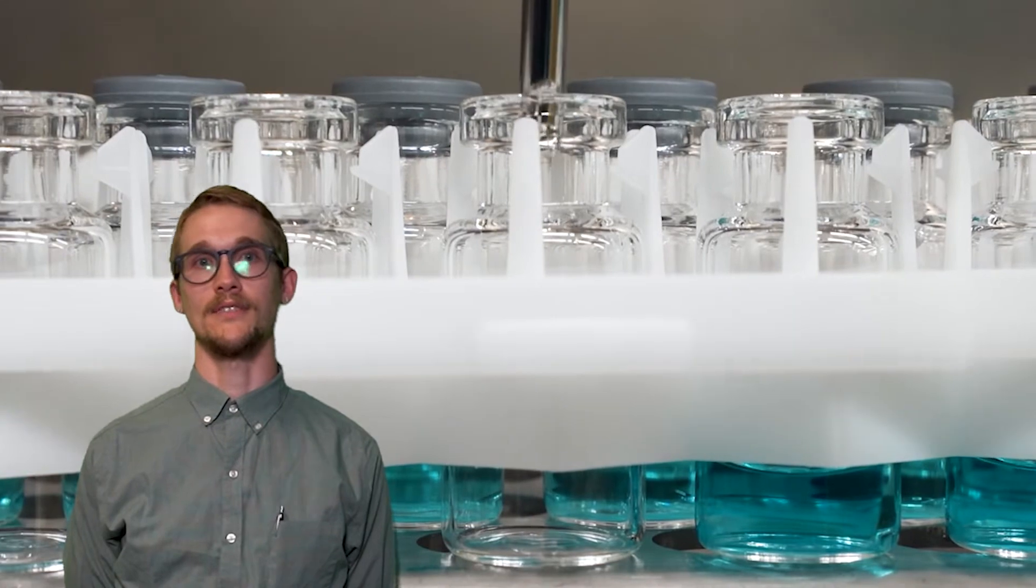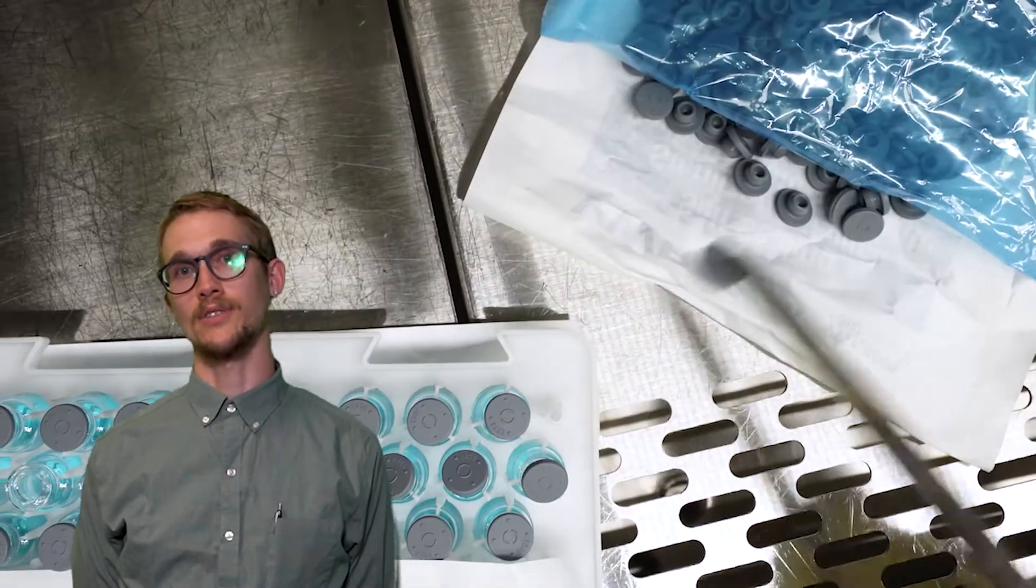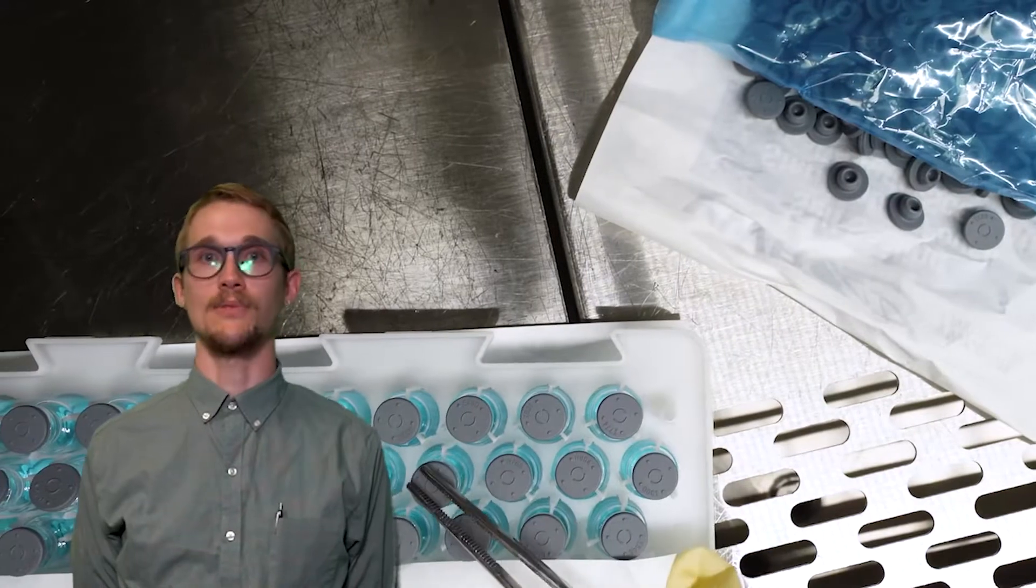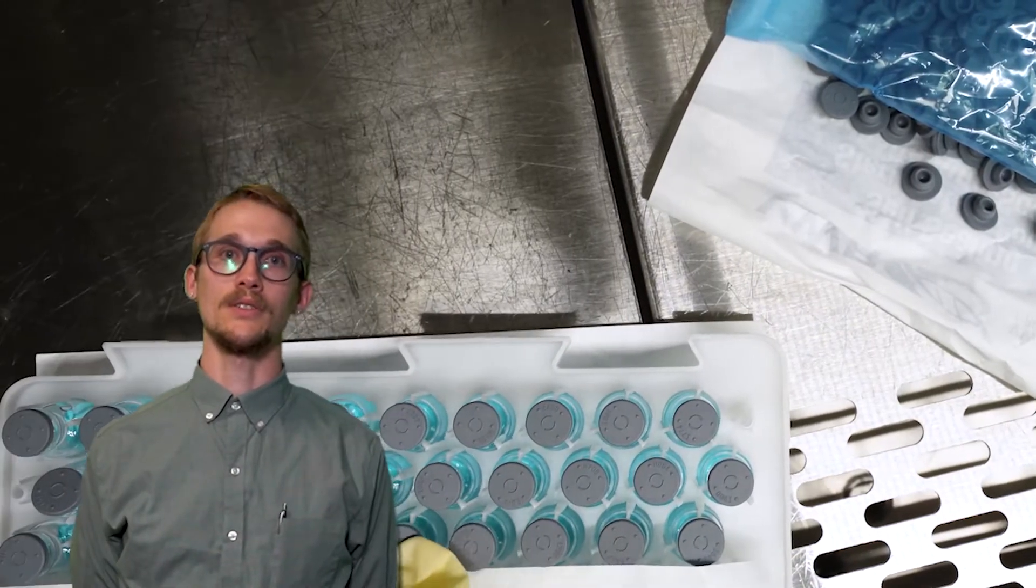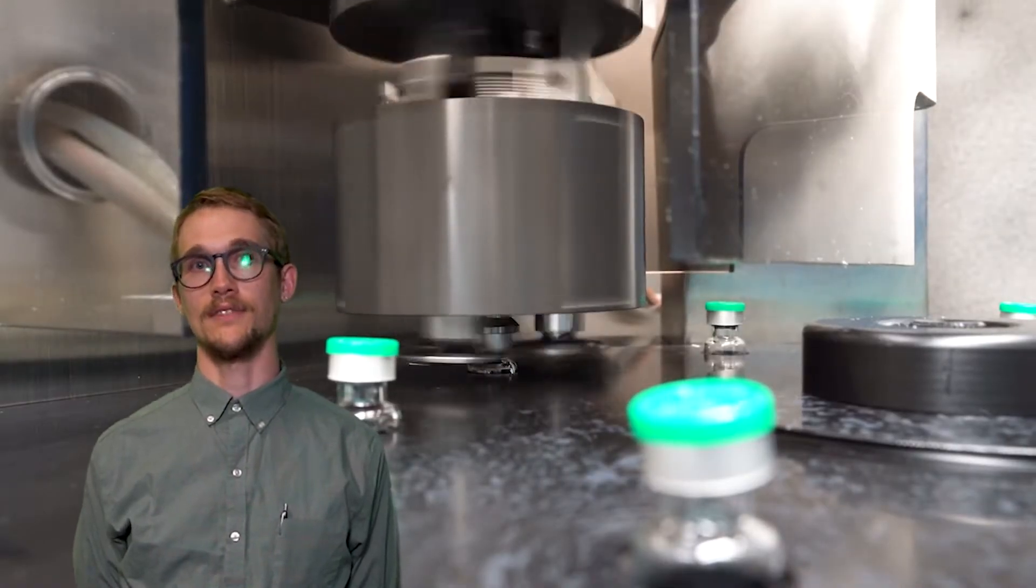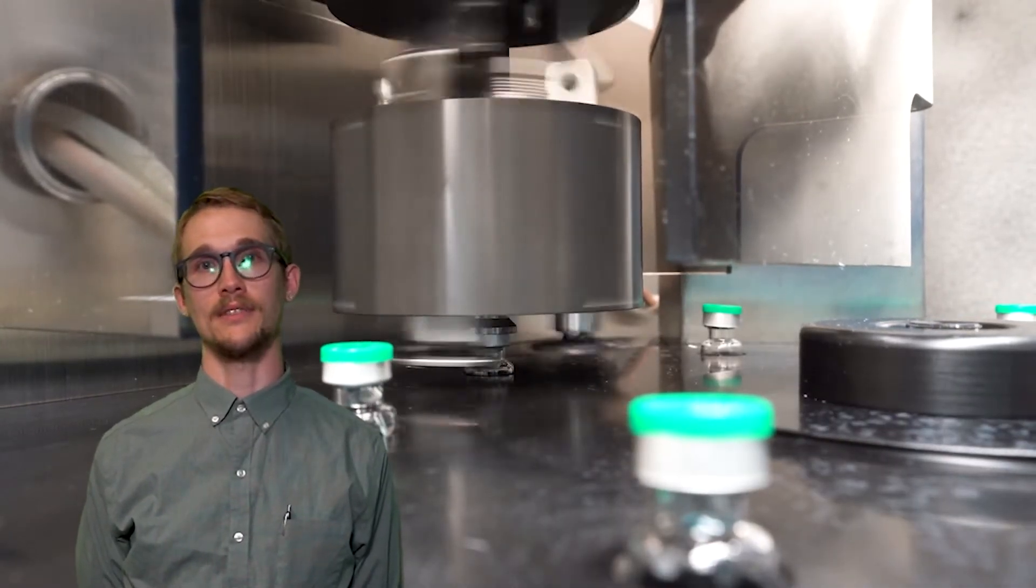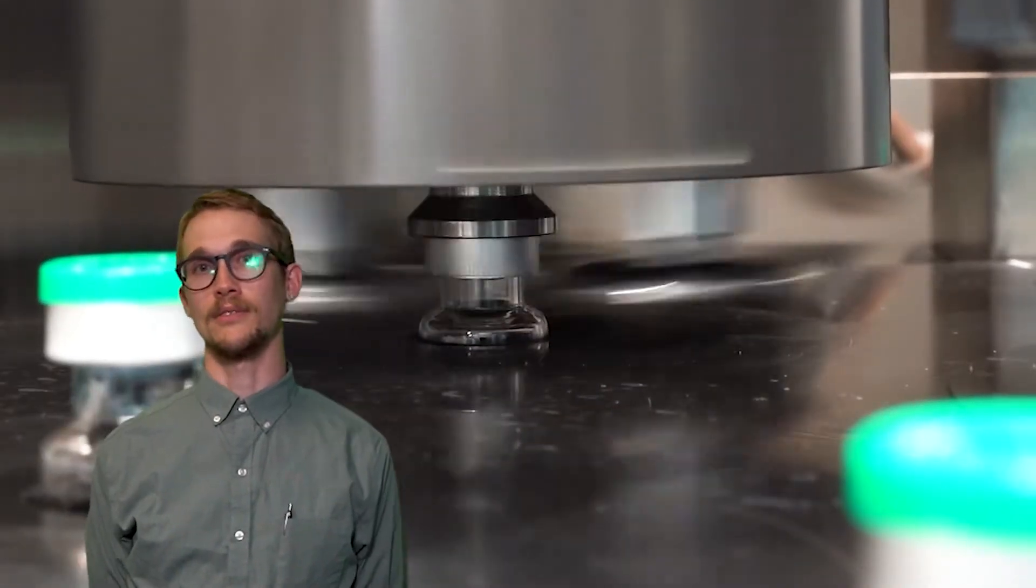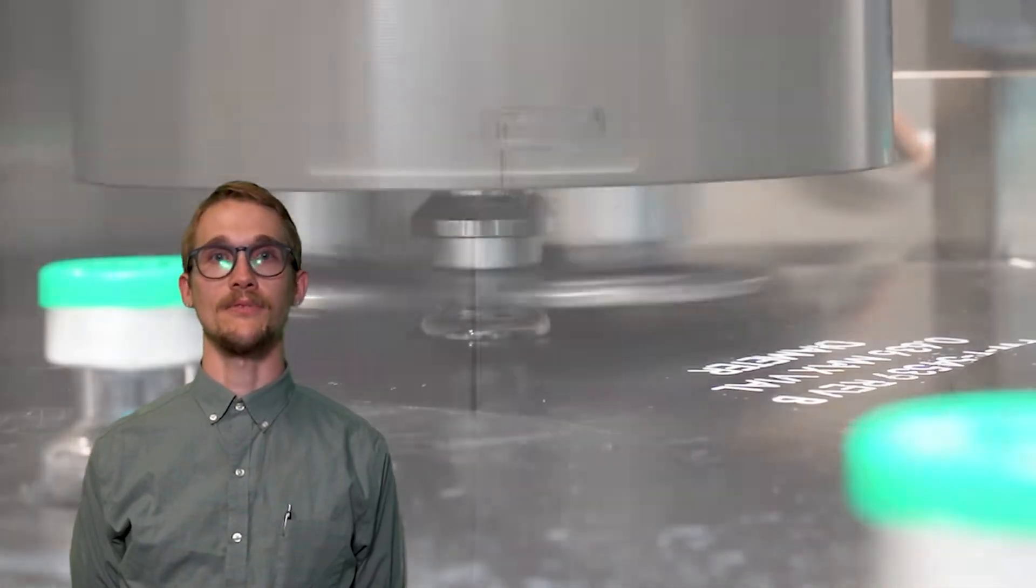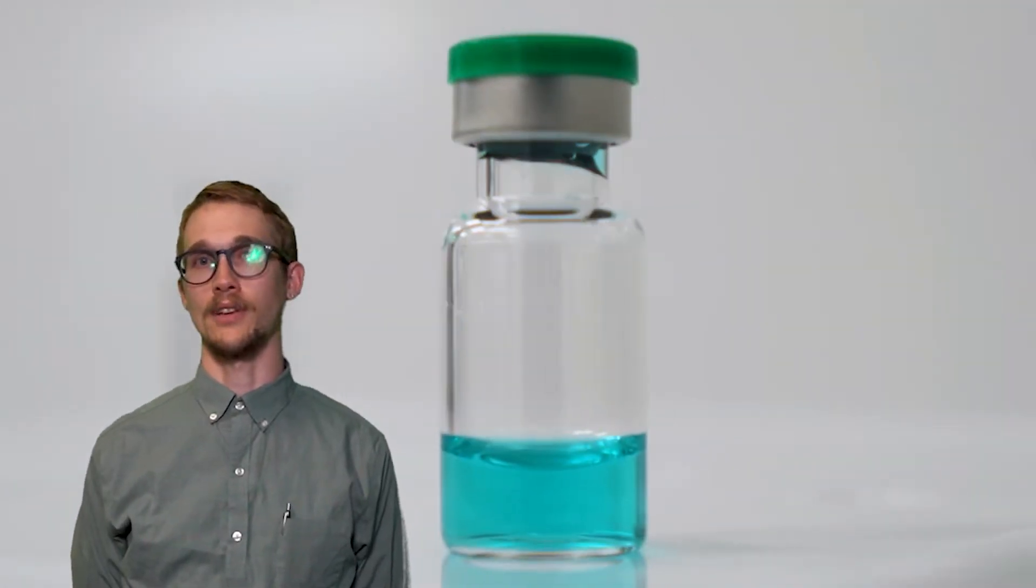Since then, it has undergone several significant upgrades. This filling line is dedicated to smaller projects, drugs which are typically in early phase clinical trials. Sometimes we only fill 100 vials, other times we may fill 2,000 syringes or more. Just like the line you saw earlier, vaporized hydrogen peroxide is used to sterilize the inside of the isolator and all of its equipment. We have filled thousands of vials, syringes, and cartridges on this filling line for many different diseases and clinical studies. Who knows? We may have filled a cure for cancer on this line. In time, many of the treatments we've filled on this line will finish their phase 2 and phase 3 trials, and they'll get to the commercial market where they can help patients in need.